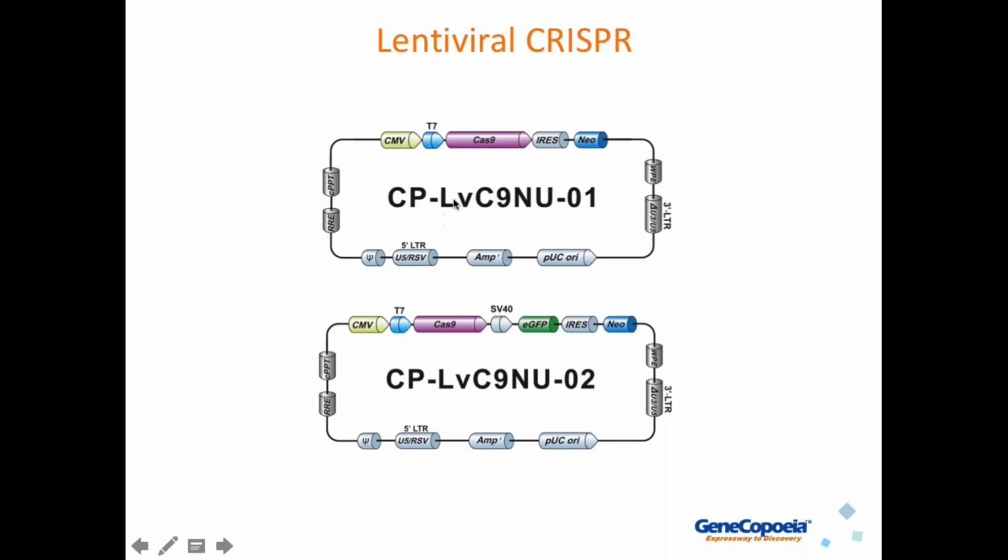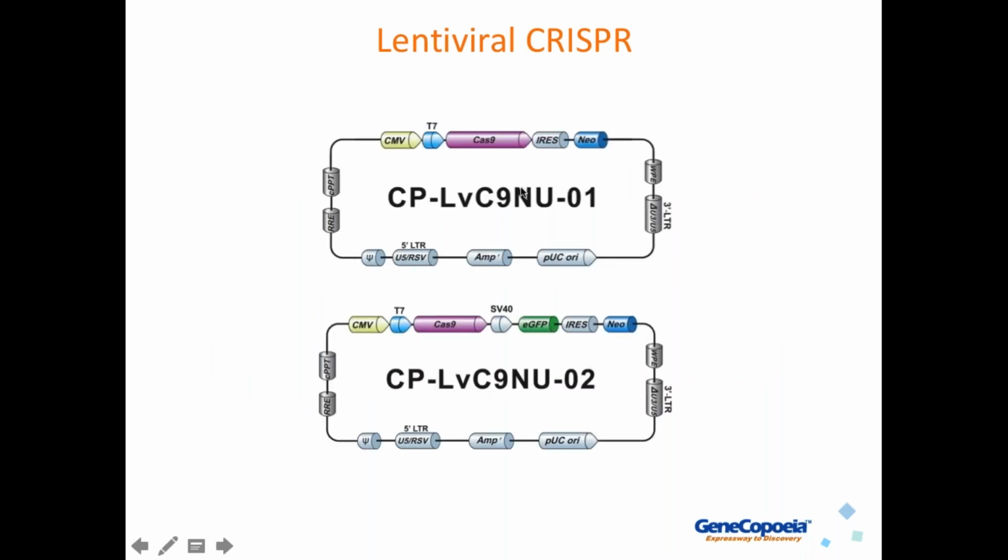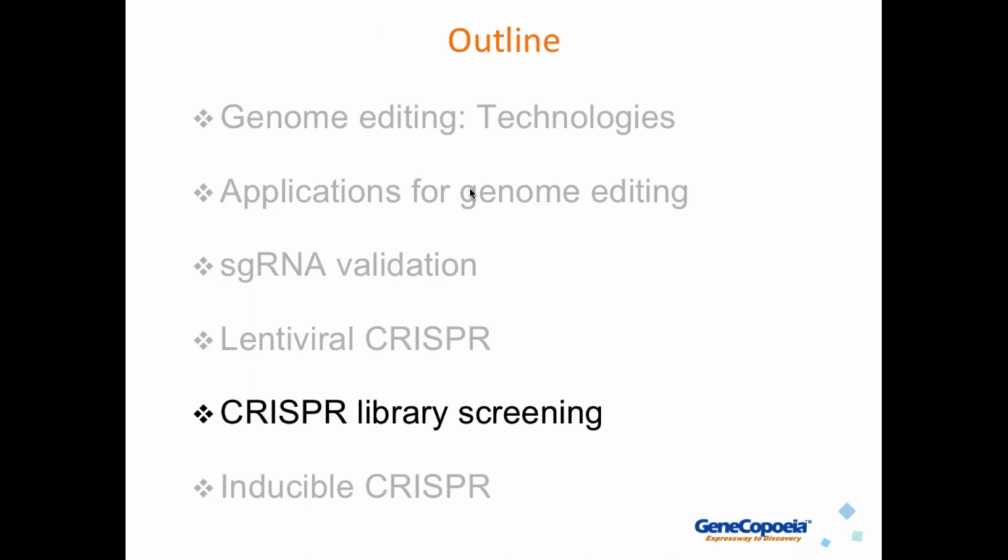And so we recommend instead either taking these Cas9 expressing plasmids by themselves and using them to establish a Cas9 expressing stable cell line, and then transducing with this CRISPR single guide RNA lentiviral construct separately, or you can do this yourself. So you get much better titer when you do it that way. You only have to transduce with the single guide RNA expressing lentivirus.